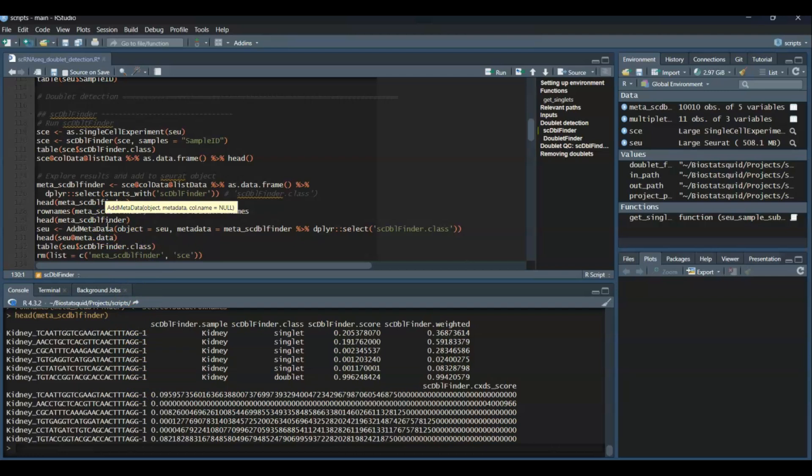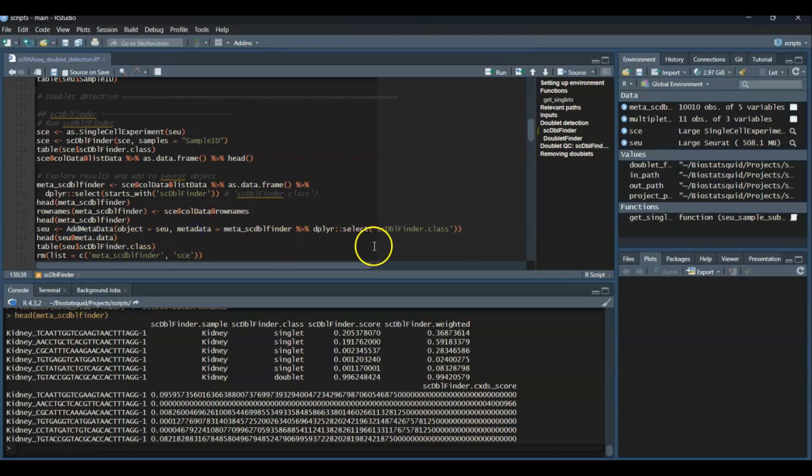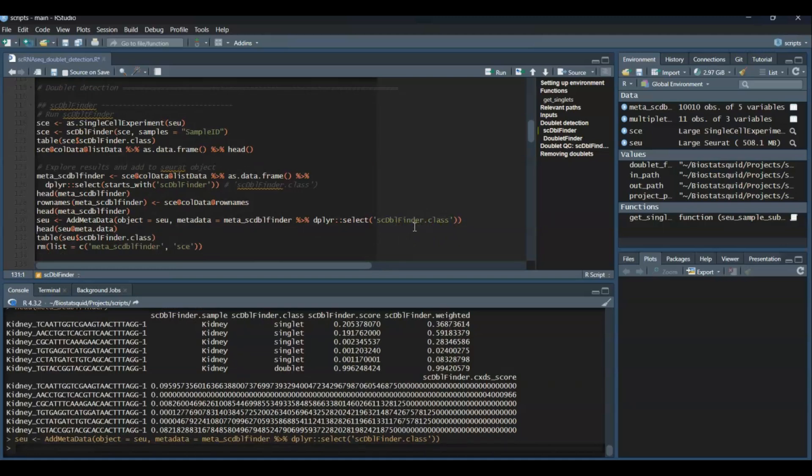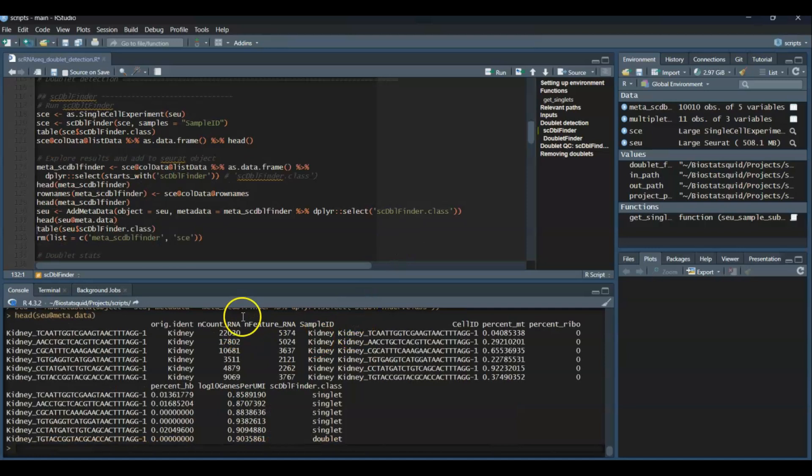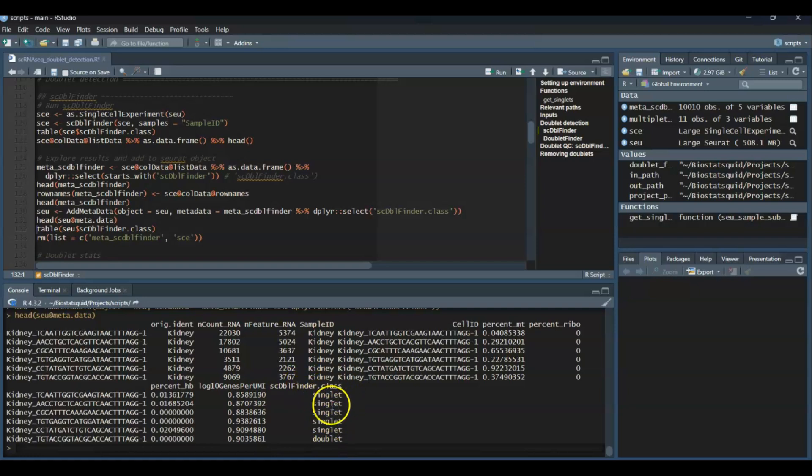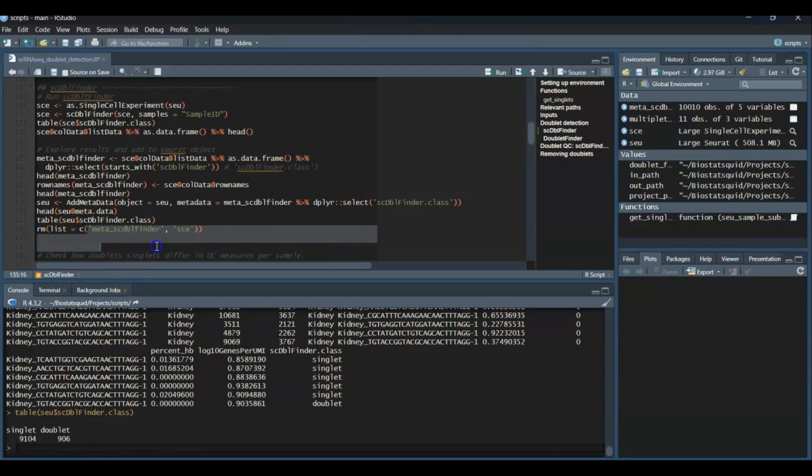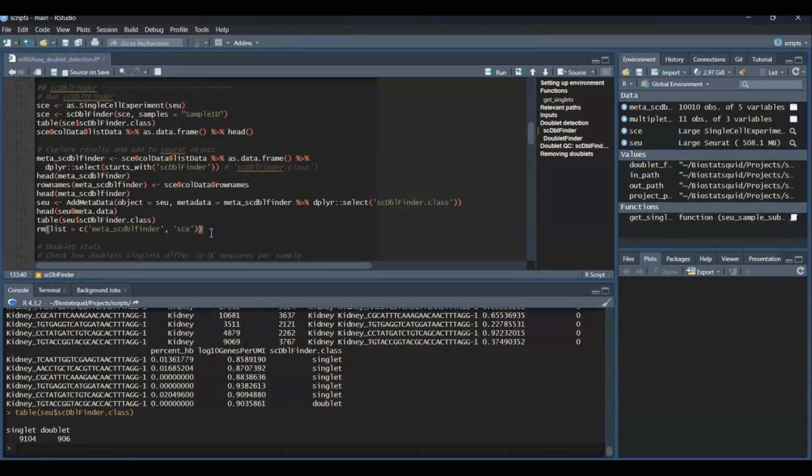Great, so now we can add the metadata with the function AddMetaData. And I'm just going to add the scDblFinder.class. But if you want to add the other columns as well, you can just remove this part that just selects this column. So feel free to also customize the name of the column. We can just check now the Seurat object. And as you can see, we have a new column in our metadata called scDblFinder.class, which has our singlets and doublet labels. And just to make sure, let's check again the number of singlets and doublets. There you go. And we can remove these temporary variables, which we don't need anymore, just to clear up a bit of memory.